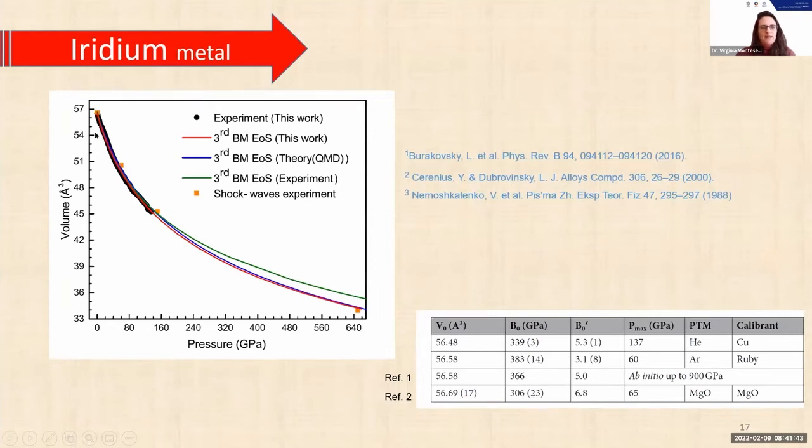If we extrapolate our equation of state up to 650 gigapascal, we can see our equation of state matches perfectly with those results obtained by shockwave experiments and quantum molecular dynamics. And this reflects the quality of our X-ray diffraction data.